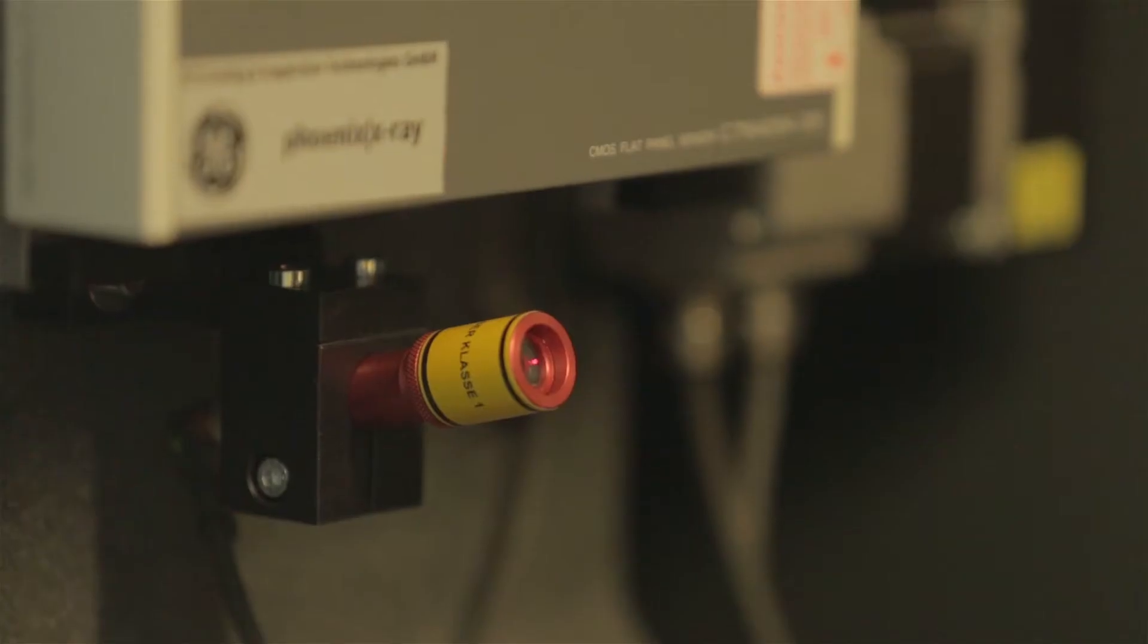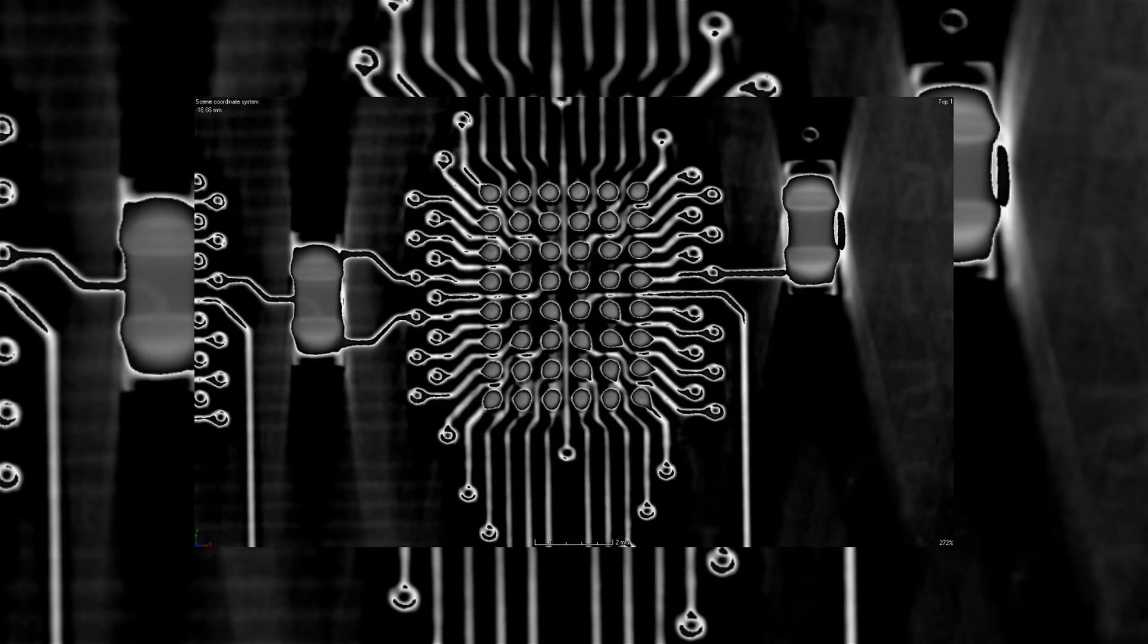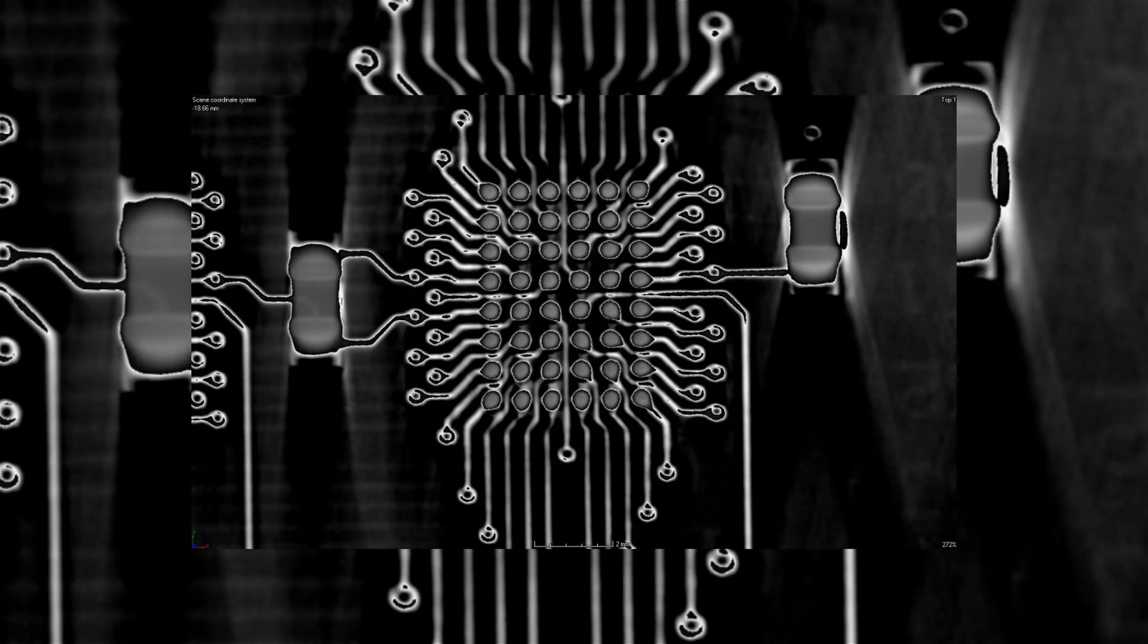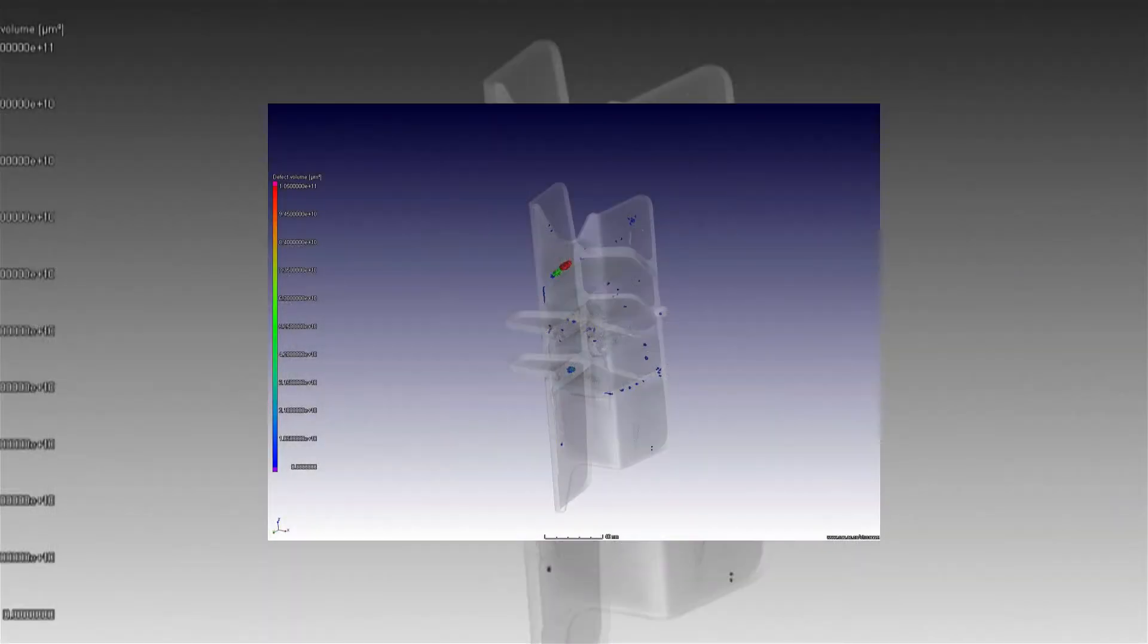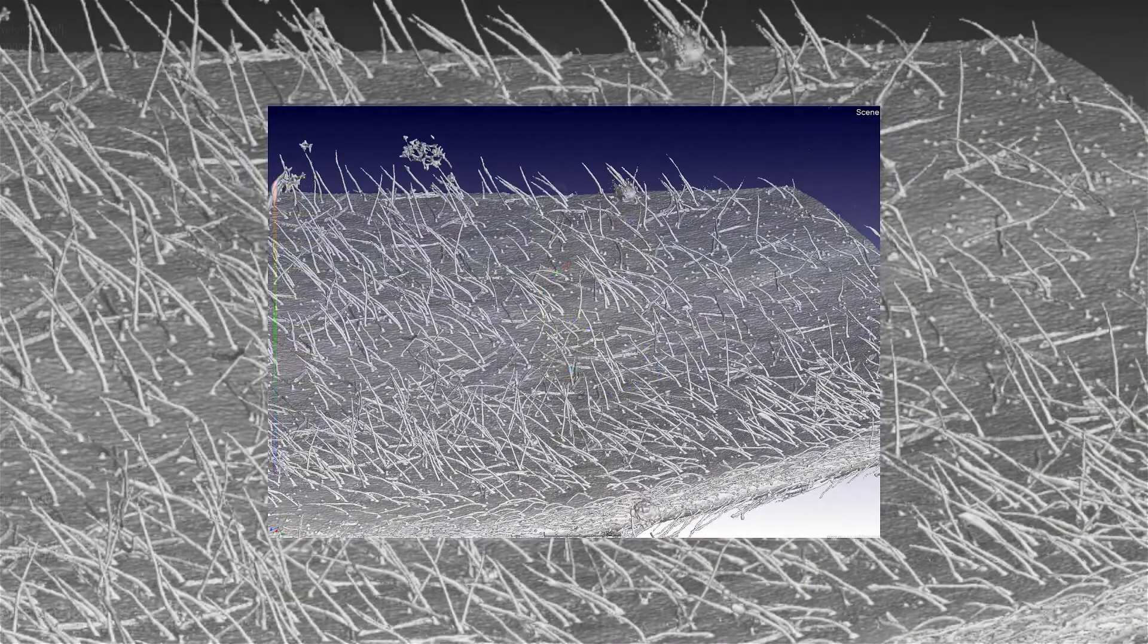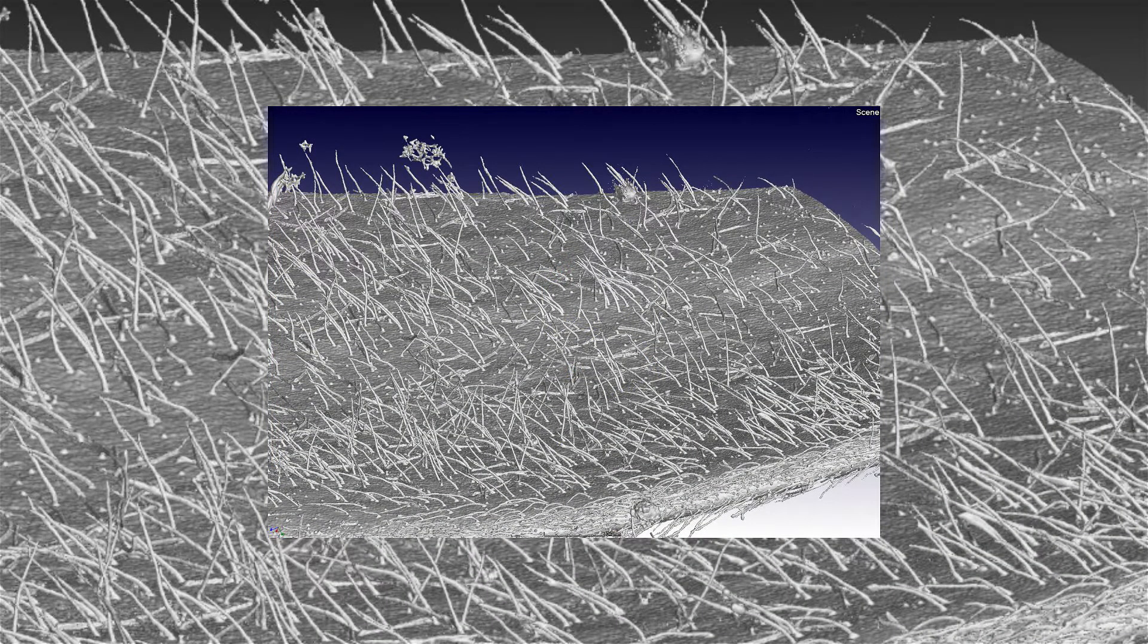The technology works with x-rays, and by sending a beam of x-rays through a sample, you can see small variations in materials like seeing cracks in metals, defects and different types of structures in biological samples, also in electronics to see when connections are good or not.